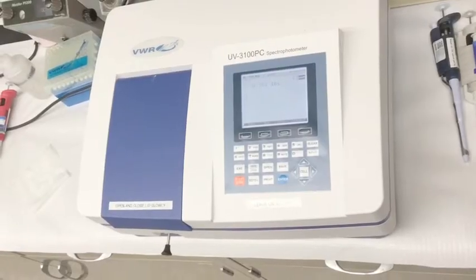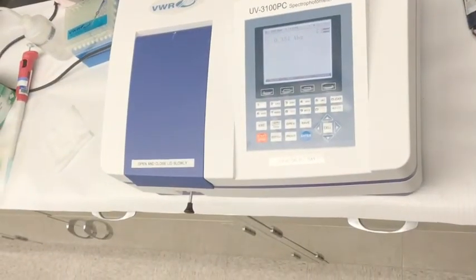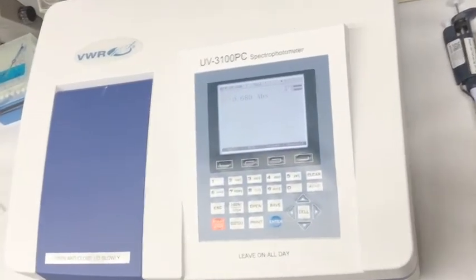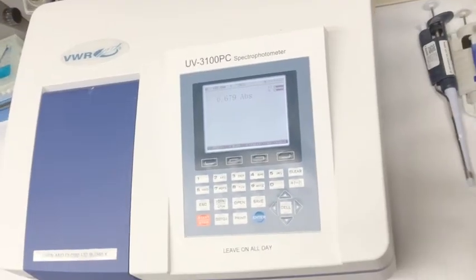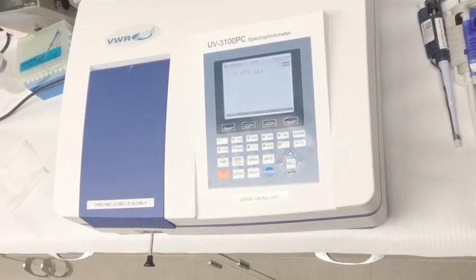In order to continue taking the absorbances of your next samples, pull the knob again to put cuvette number 3 into position. As your sample concentrations increase, your absorbance readings should also increase. Finally, pull the knob one more time to read cuvette number 4.